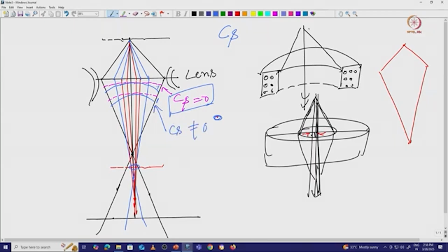In most lens systems, you can see that the magnetic field is uniformly distributed in theory, but in the actual case it is not uniformly distributed, and it is going to affect how the electron beam converges and at what particular point it gives us an image.